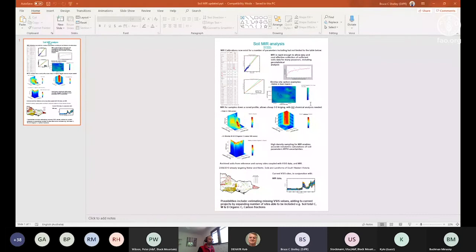no wet chemical data. And in particular, soil physics being slow and expensive, as we've become more interested in soil water properties, we're starting to go through and develop predictions for data sets that are being used in a lot of the current research. We also use it for harmonisation of contemporary and legacy data.